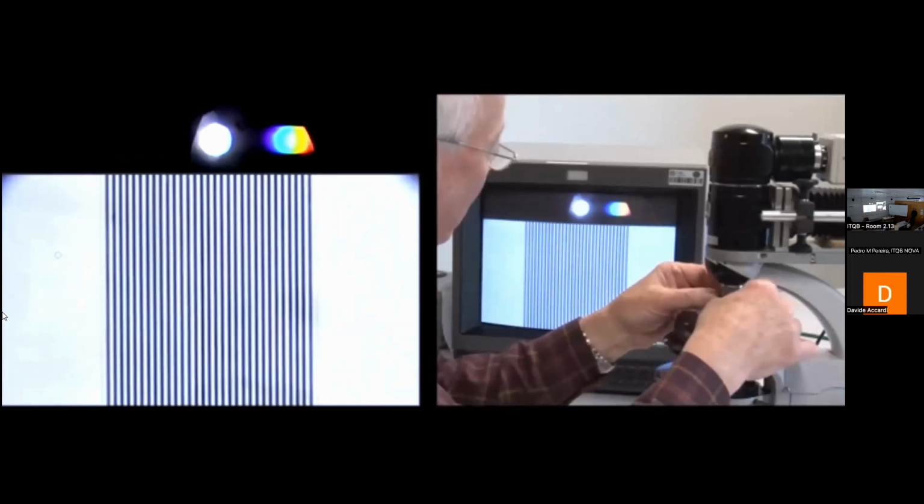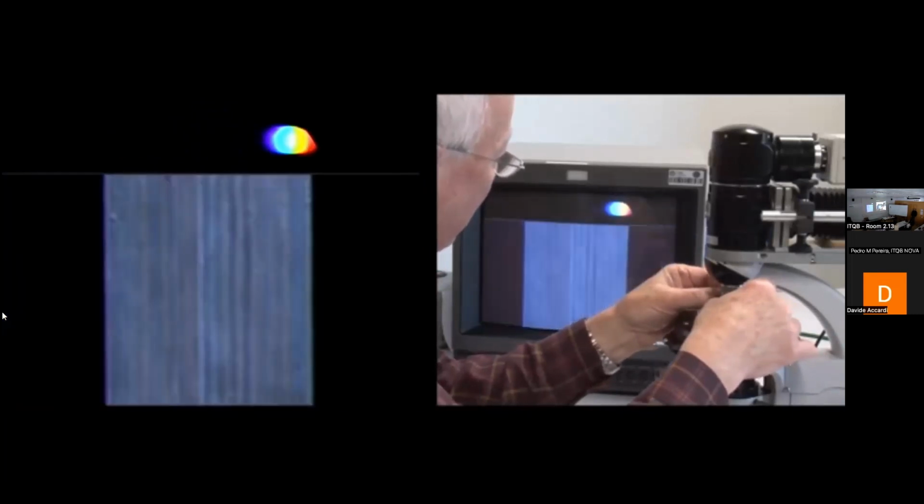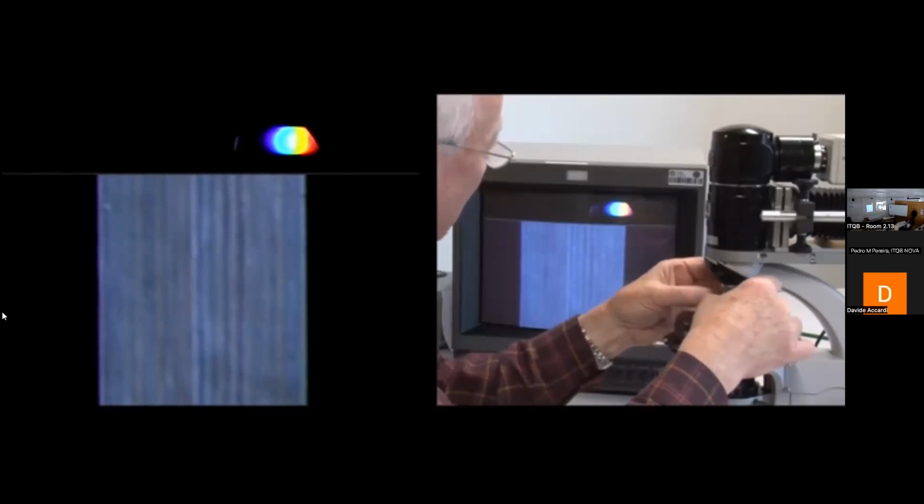Do we need those two beams? Clearly we need the diffracted beam, because that we've already seen is the information. But if we simply include the one beam, the diffracted first order beam there, we're not resolving.